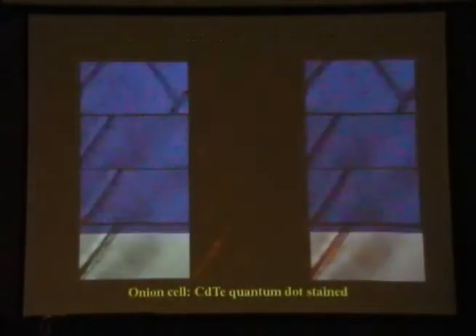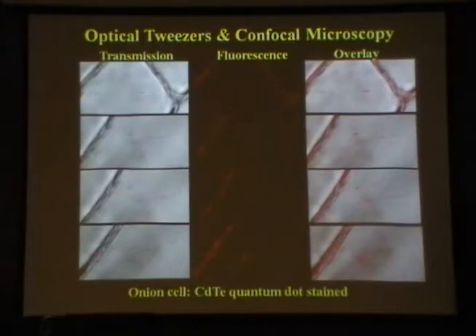And you can also have autofluorescence with a confocal microscope. Here we have our homemade system, and we have to ask for a special order for them to fit into our size system, and they have to fit right on top of the detectors that we have there. And use the right dichroic to send it there. But I believe in August we're going to have the system, everything put together.